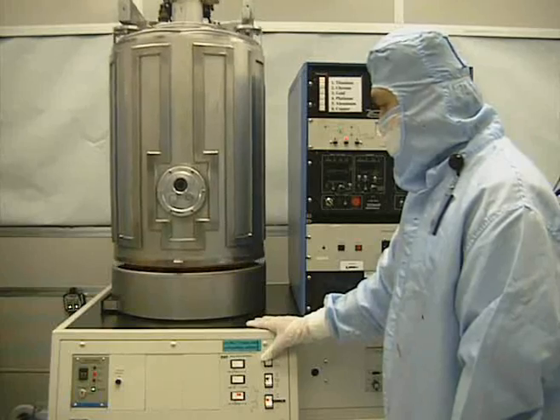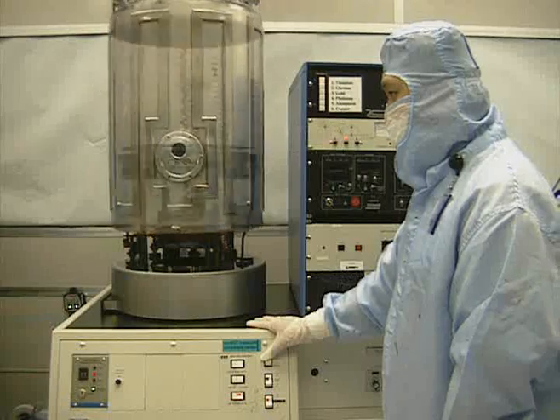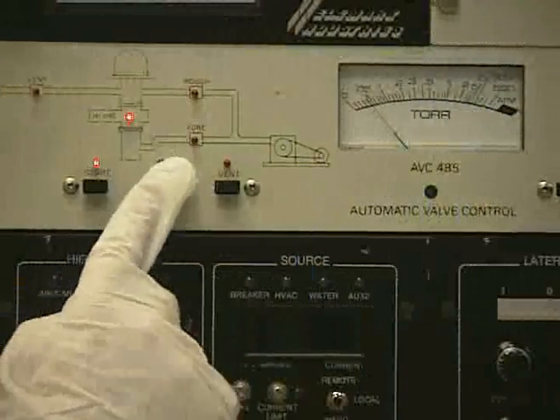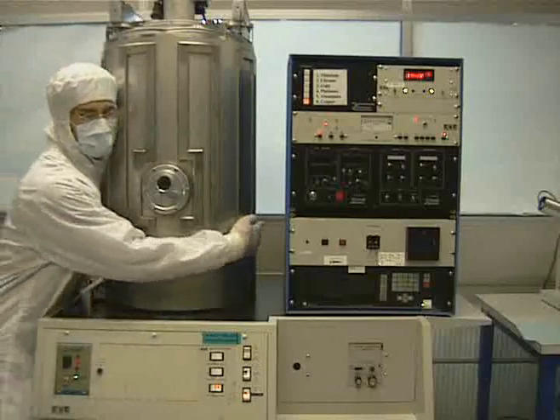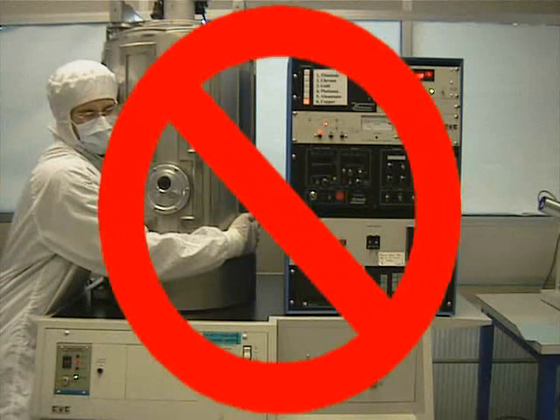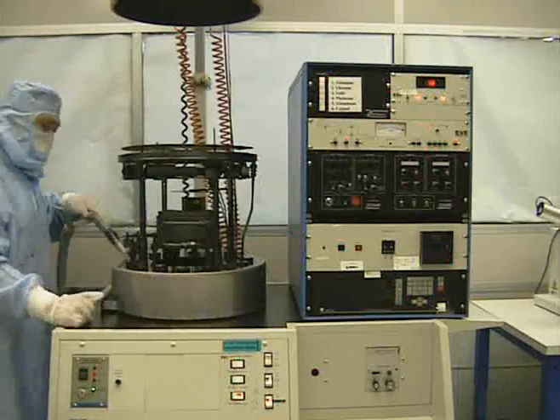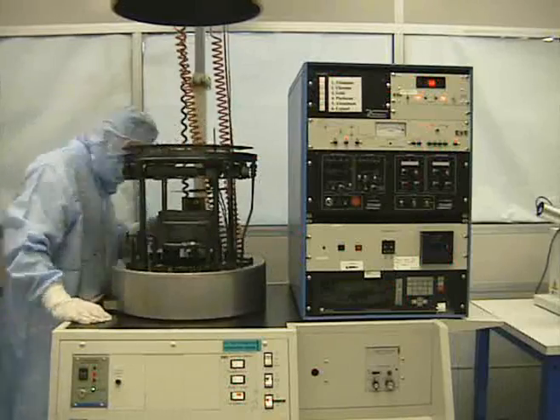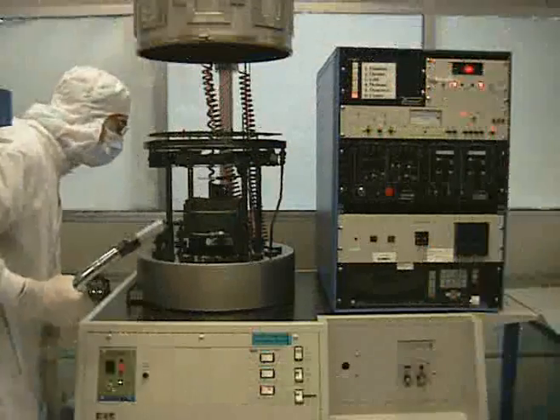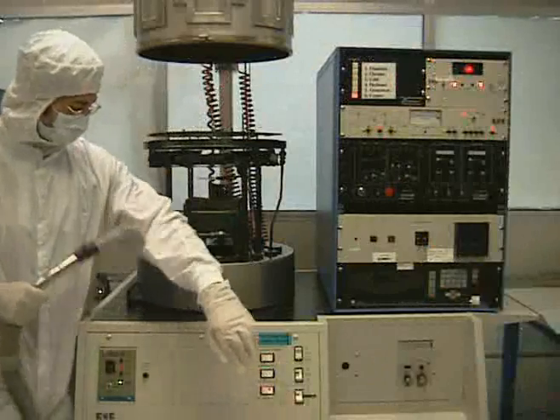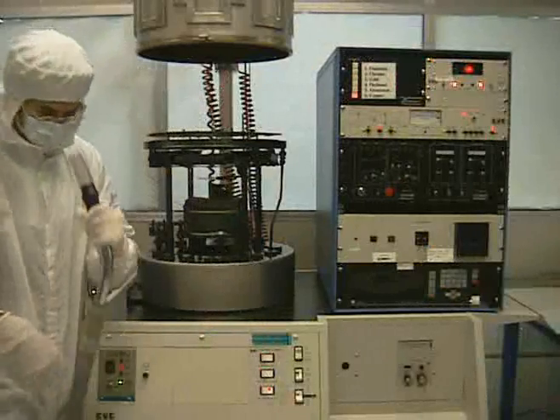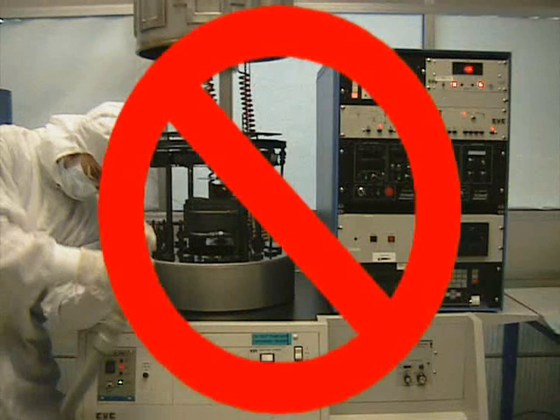Then press the hoist up button on the hoist controller in order to raise the chamber all the way. Do not try to hoist up the chamber before the chamber is completely vented, and be sure to use the hoist up button instead of using your strength. Clean the area by vacuuming any flakes or debris that have been left on or around the chamber. Cleaning the area helps create a better seal between the metal and the rubber. It is very important to vacuum the area. Do not forget to do it.